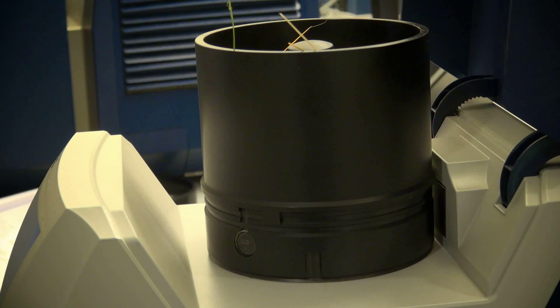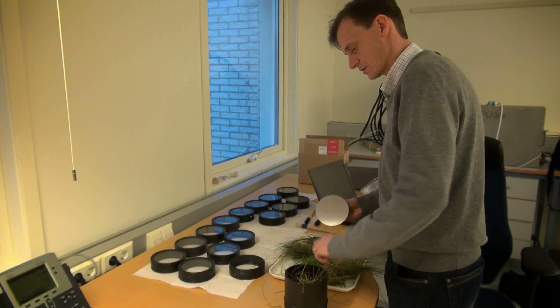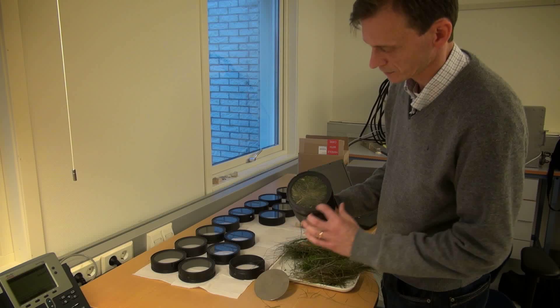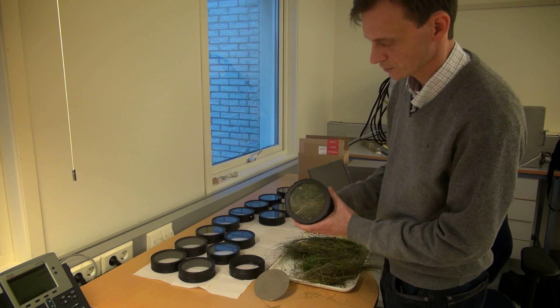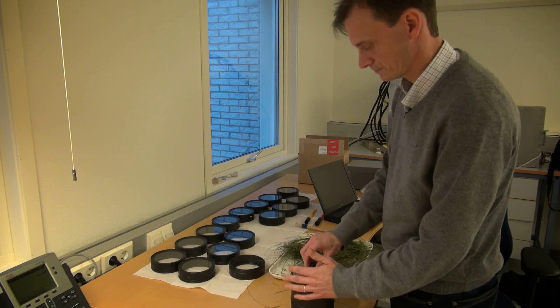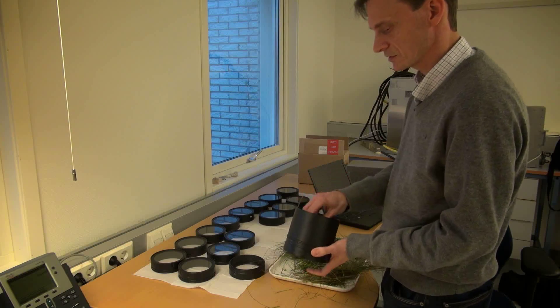You would probably need some kind of sample presentation where the sample cup is actually moving, to be able to measure on different parts. As the NIR light measures on a quite small surface, you have to move the sample around to measure as much as possible of it. It's a reflectance NIR, and I think the important thing is to have the surface which you measure flat. It's easier to have the light source from underneath, because it's easier to pack the sample.